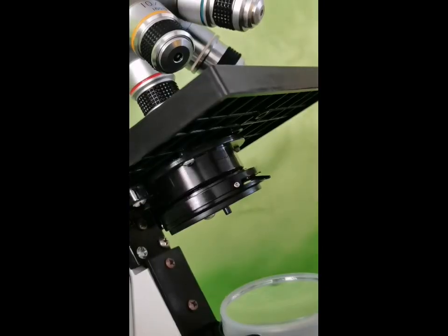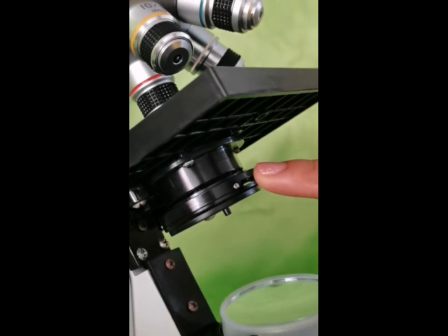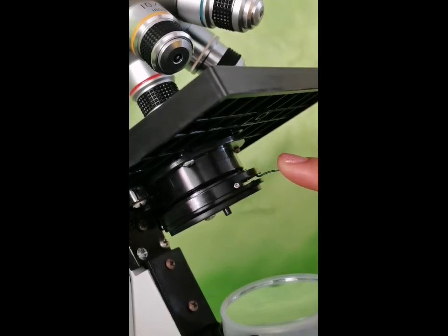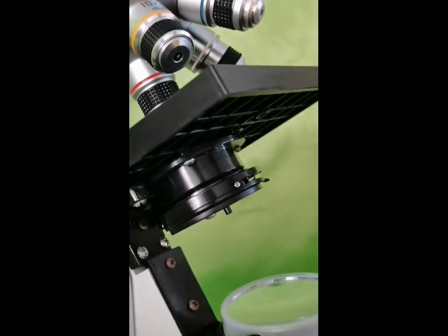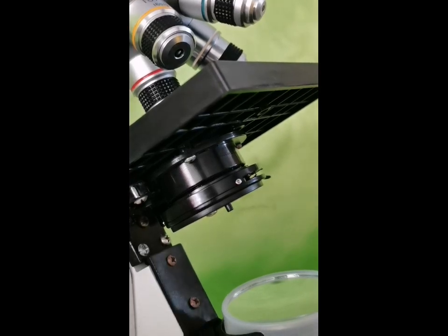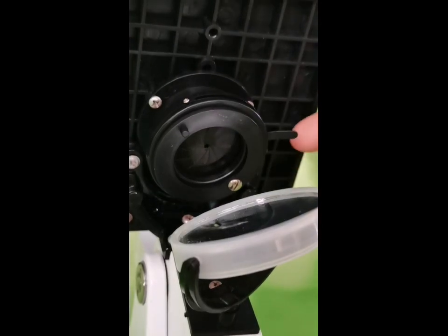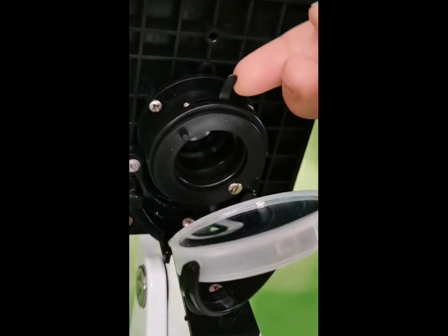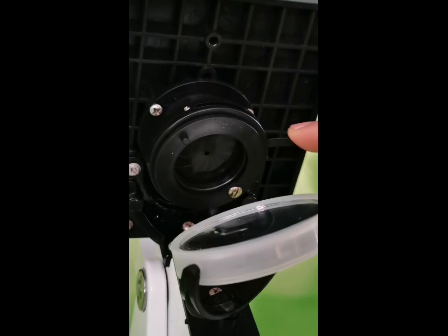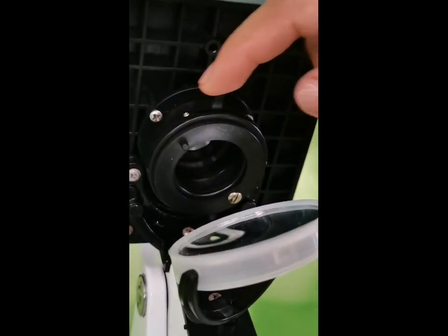The next one is the condenser. It is found beneath the stage. It concentrates the reflected light from the mirror to the specimen being examined. Last is the iris diaphragm. It is a thin structure with an adjustable opening located at the mouth of the condenser. It regulates the amount of light that enters the condenser.